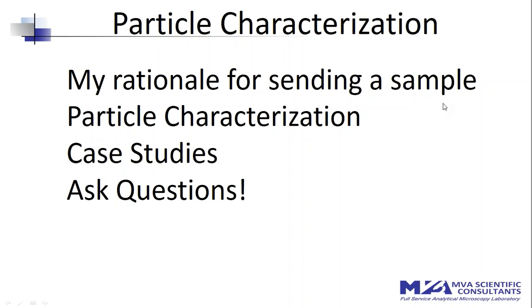An explanation of forensic industrial investigation, which is what I primarily do, is the application of analytical techniques to determine the cause of product failures, defects, and product returns for manufacturing. The types of samples and industries that we serve that are in-house now, we have pharma, drugs, medical devices, drug delivery systems, chemical manufacturing, anywhere from fillers to fertilizer. We work for aerospace, we look at coatings, we look at engine components.